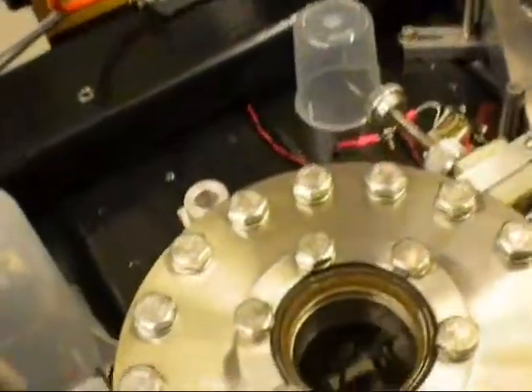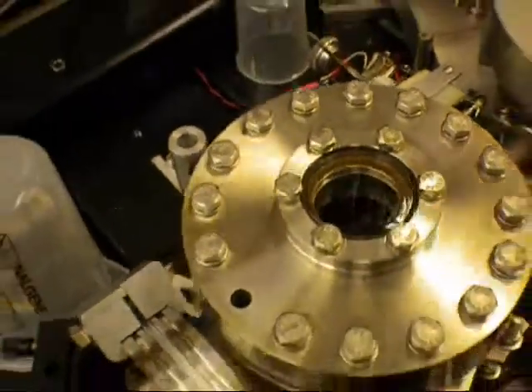So in this case here, for example, the output coupler is located in this compartment here. So if you look through there, you may even be able to see the mount associated with that output coupler.